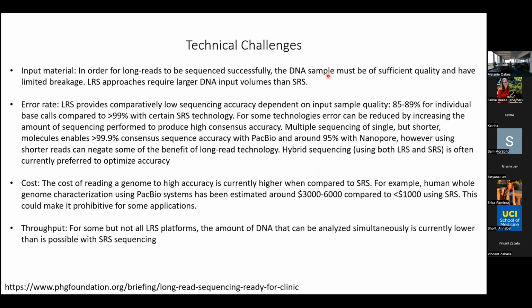Some of the challenges for this is that it needs a lot more sample. They're getting better, there are these low input protocols, but the standard protocol is 5 micrograms of sheared and concentrated DNA. Sometimes people can't give you 5 micrograms. And for comparison, what is it for Illumina? For Illumina, we can go down to sub-nanogram amounts if really needed to. Wow, so there's at least 3 orders. Yeah, we prefer higher amounts, because I don't like to give you a lot of repetitive reads.